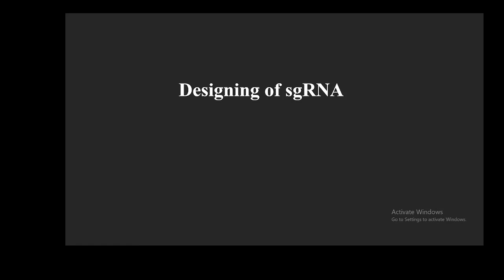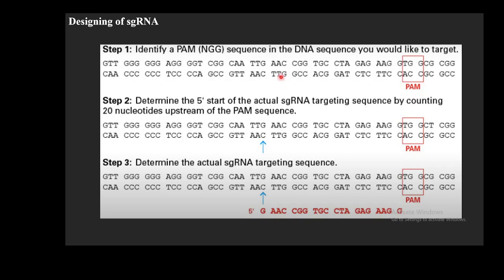I am currently giving lectures on CRISPR and today we are going to cover the topic of designing of single guide RNA. Suppose, how you can design the single guide RNA.